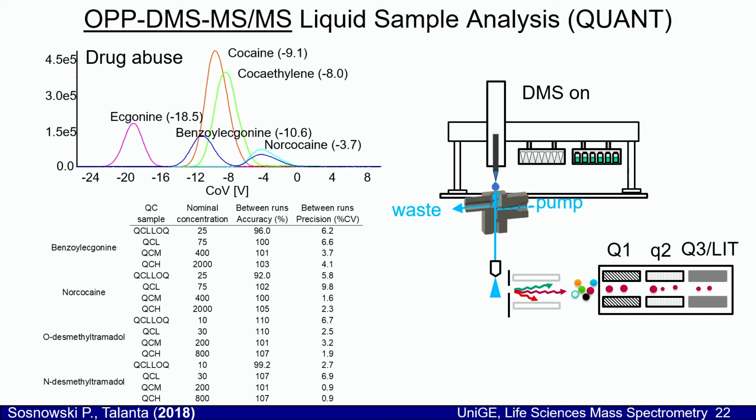Also with respect to quantification, the performance is quite good regarding accuracy and precision for drug molecules. This is similar to flow injection analysis, which doesn't have any pre-cleanup step, but DMS comes in nicely here because it's separating the ions after ionization to achieve selectivity.